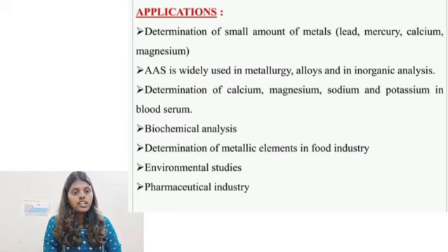It is also used in the field of environmental studies and for the determination of metallic elements in the food industry and the pharmaceutical industry. These are the major applications of atomic absorption spectroscopy.